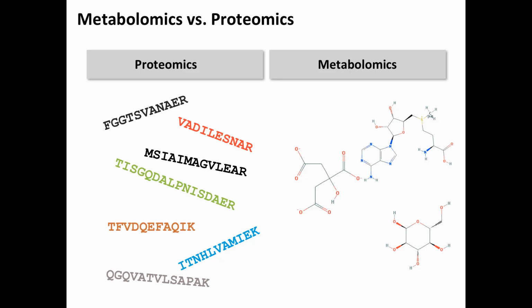Where we saw that peptides basically break at the backbone, at the peptide bond, or to the left and right to it. Metabolites can basically break in very arbitrary ways, and oftentimes the spectra are not as informative. They have fewer peaks because the distribution of bond energies is different than in peptides. You end up with 5 or 7 peaks that do not convey as much information as you would like, or as you're used to from peptide spectra.